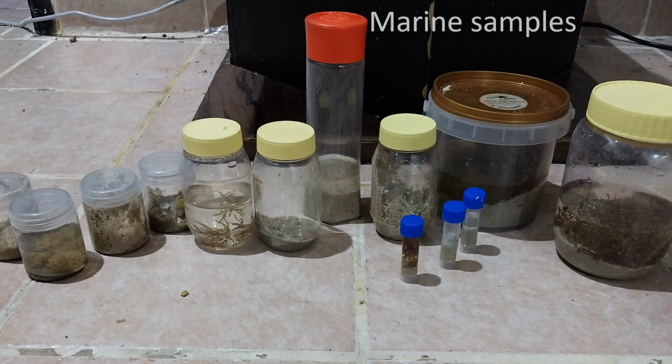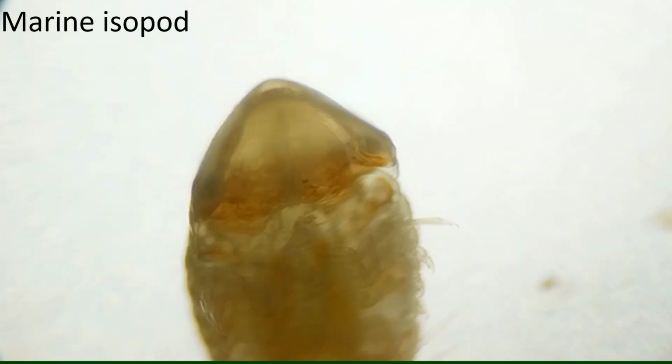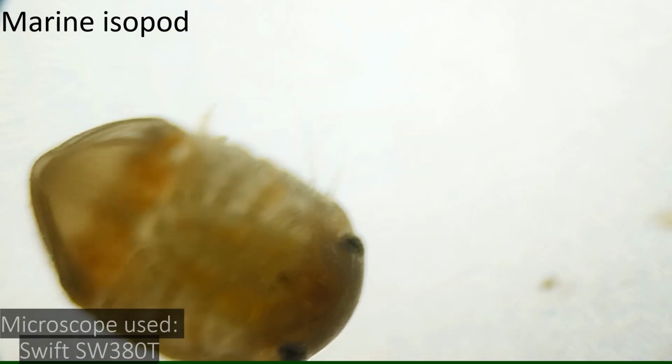A few weeks before the release date of this video, I was able to collect some samples from a beach, and I put them under the microscope to observe the marine microbes that inhabit them. The first creature that I saw is this marine isopod.